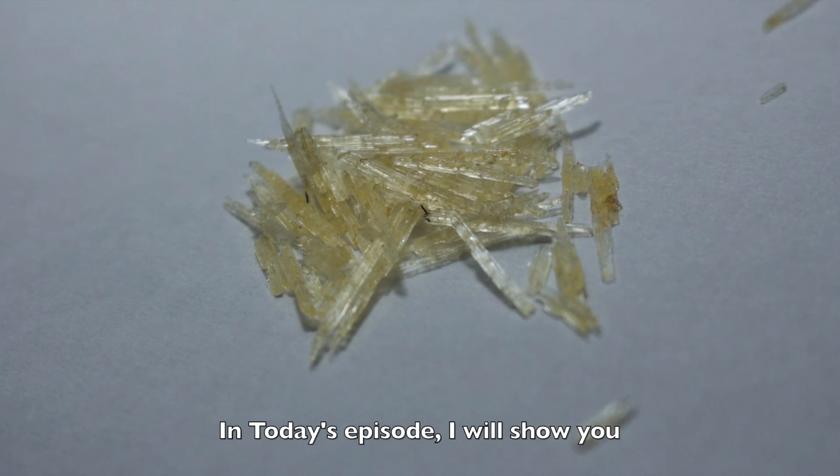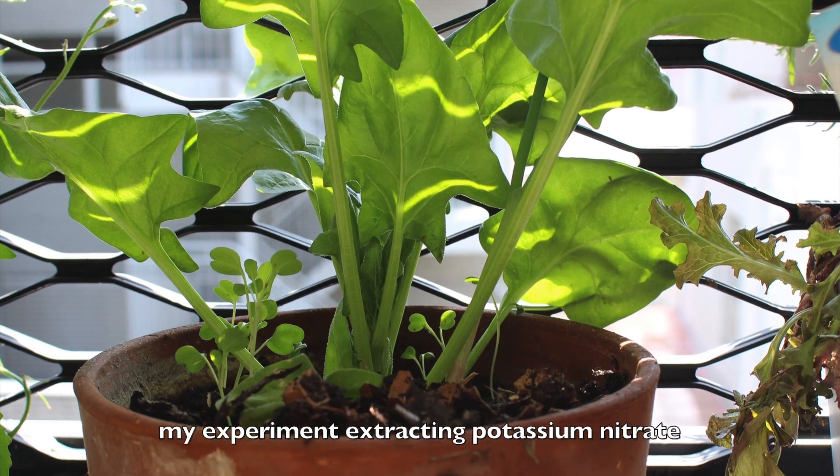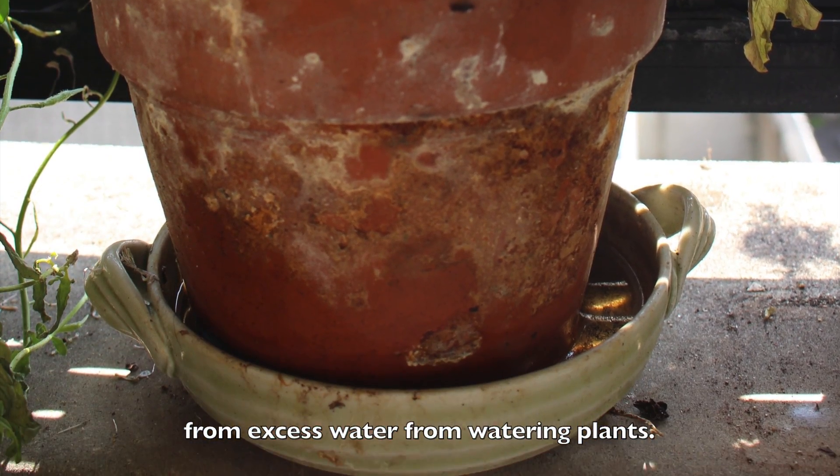In today's episode, I will show you my experiment extracting potassium nitrate from excess water from watering plants.